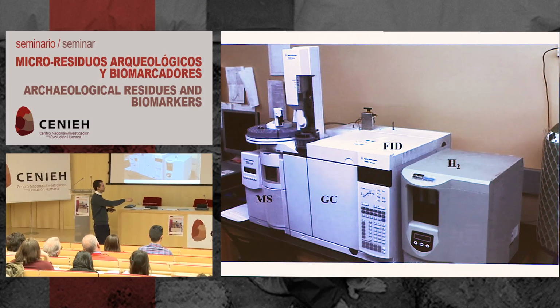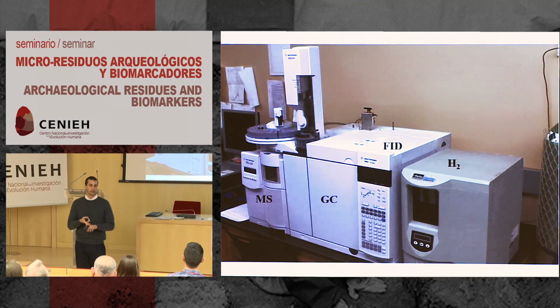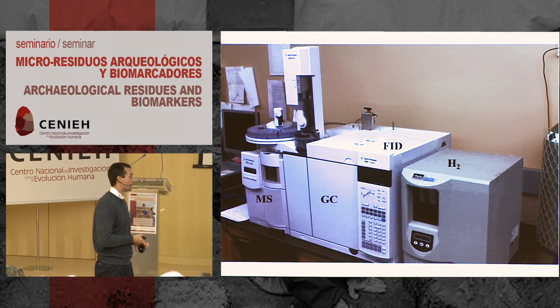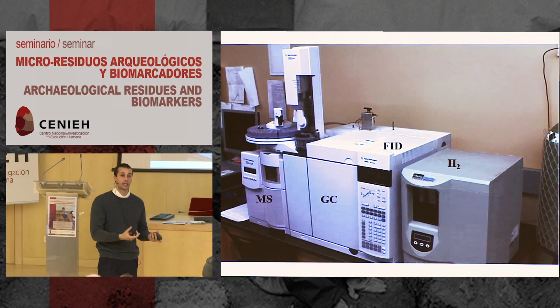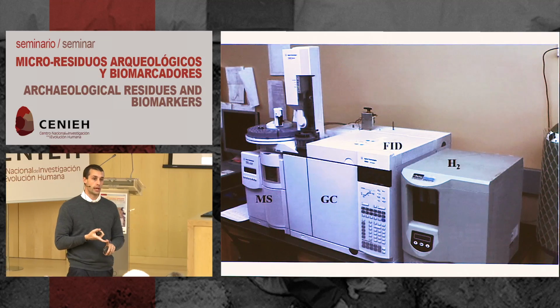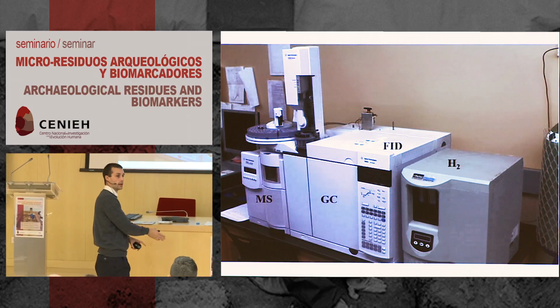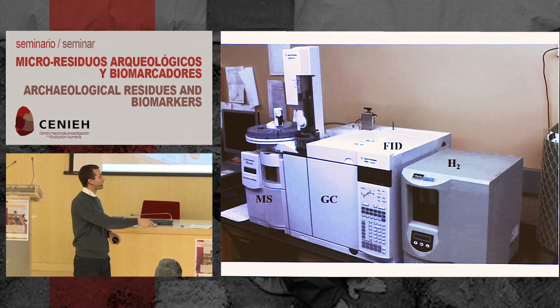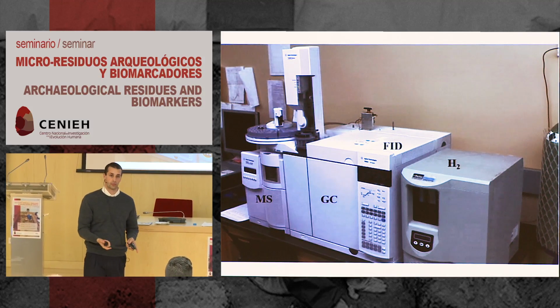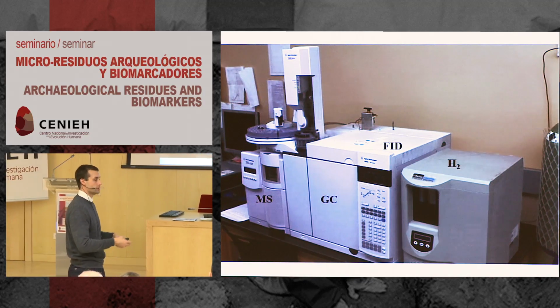The MS, the mass spec, isn't actually used in this technique. So the one issue with FID is that you can't get the computer to tell you what it is you're looking at, what compounds you actually have. The nice thing about a mass spec is it has a data library, and the library will tell you what it is you're actually looking at. For the FID, you have to use a reference standard. So if we have an N-alkane reference standard from C9 to C39 or whatever, we also have to do the exact same technique for analyzing the reference standard with your modern samples. So you have to compare the peak abundance with the time frame and do an actual matchup of, say, something like C25.